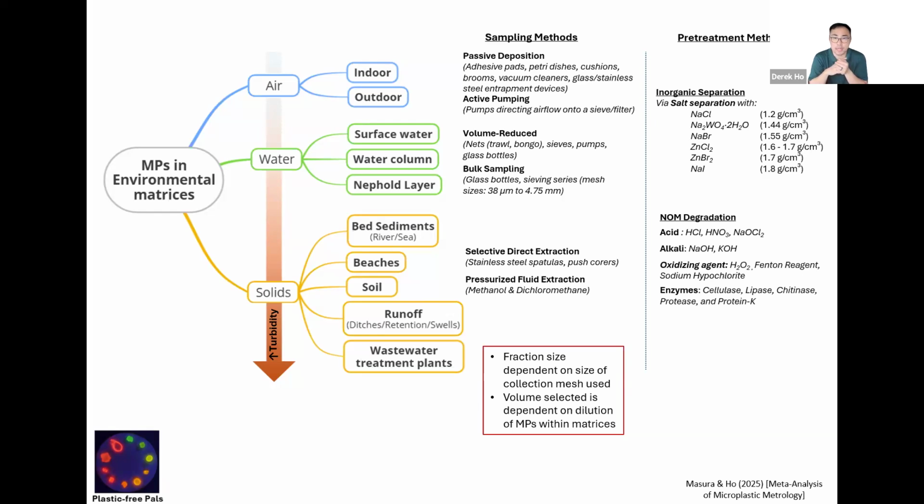So there is another layer that will have to be done by trial and error before we dive deeper into the standards which we want to use for our own personal work. Typically, 2 liters is sufficient, but people can go up to 20 liters or even hundreds of liters.